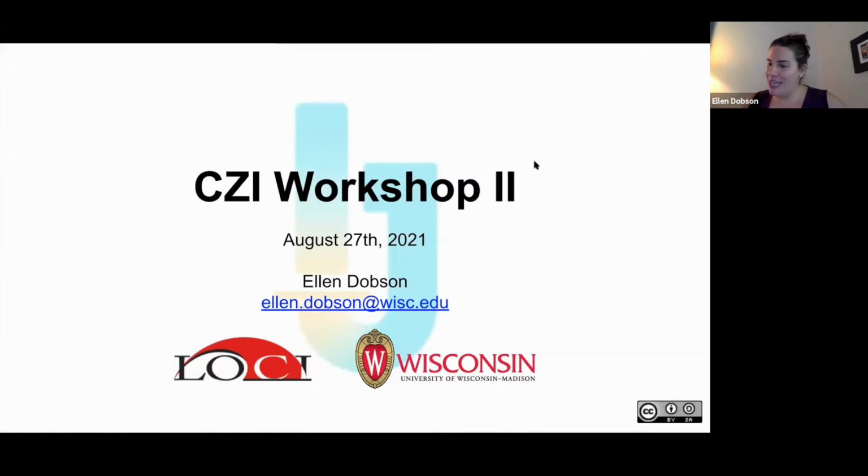So let's start today. Okay, so we're going to start the second workshop on ImageJ.